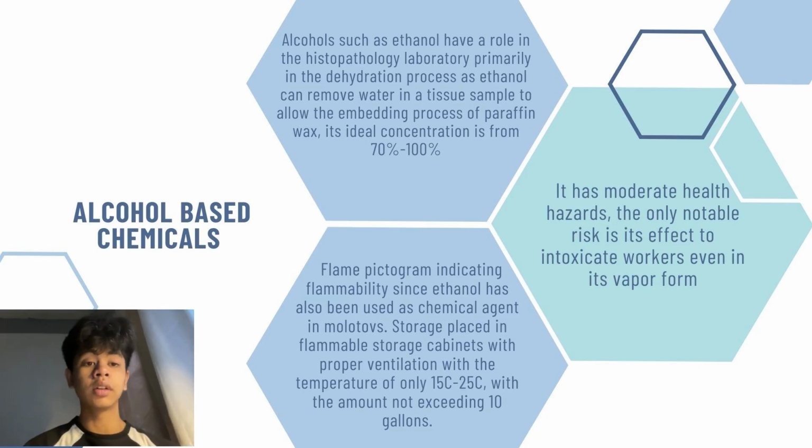Next, we have our alcohol-based chemicals. Alcohols such as ethanol have a role in the histopathologic section, primarily in the dehydration process, as ethanol can remove water in tissue samples to allow the embedding process of paraffin wax. Its ideal concentration is actually at 70% to 100%.